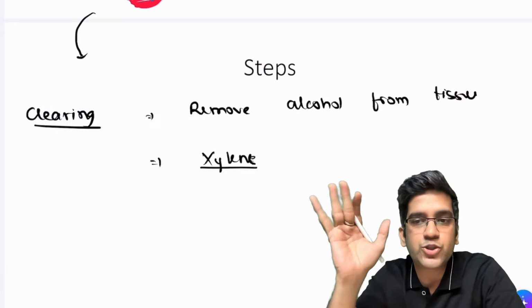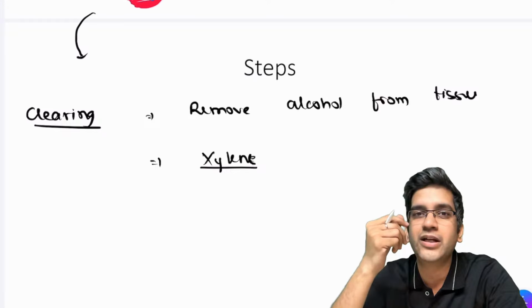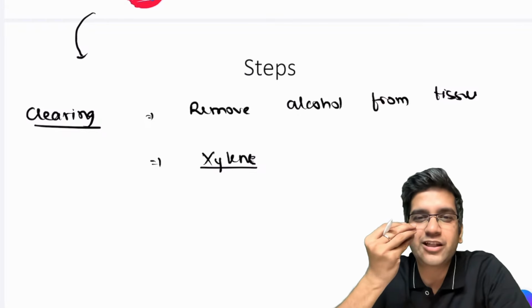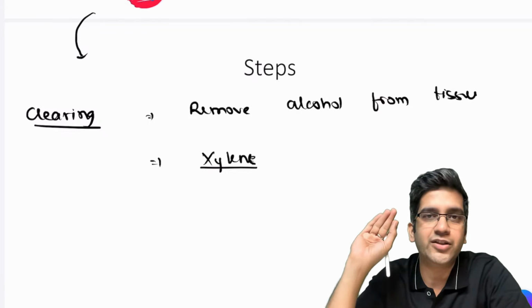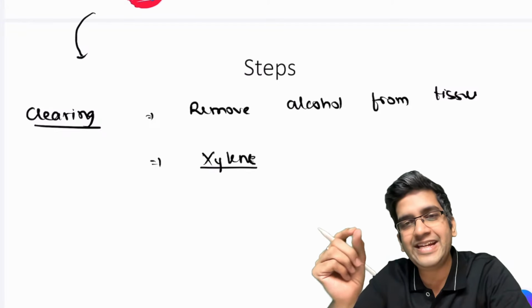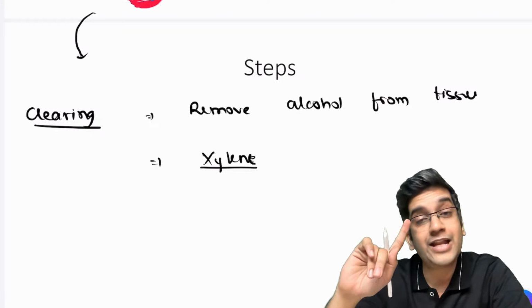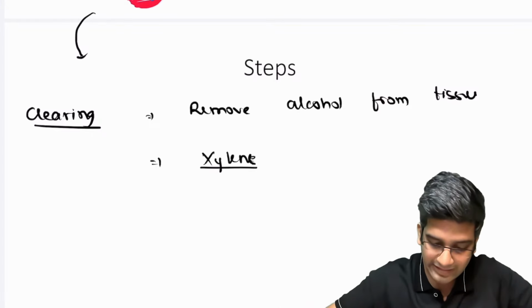Again, if you cross the histopathology lab, you might smell a varnish smell. Next time, near the processing machine, you will notice it has a turpentine or varnish kind of smell. It's xylene. It's very, very efficient. It will remove any tiny trace of alcohol present. But the problem is it's toxic, and it should not be exposed for a prolonged time. If it is exposed for a prolonged time, it will cause brittleness.